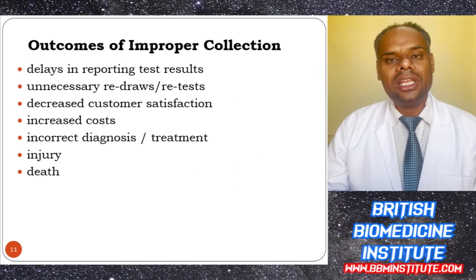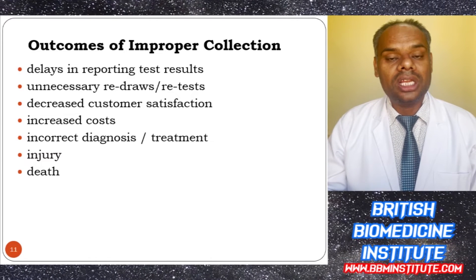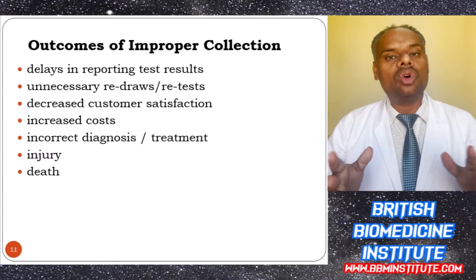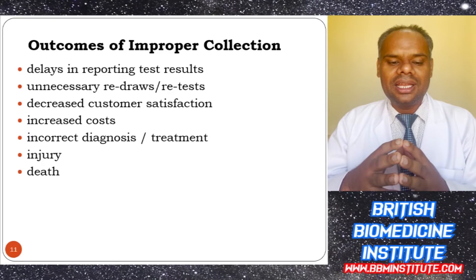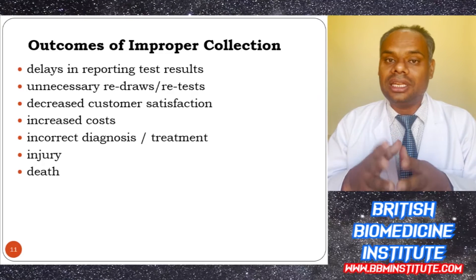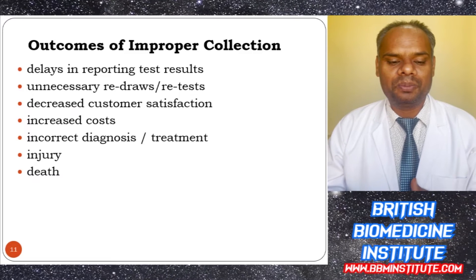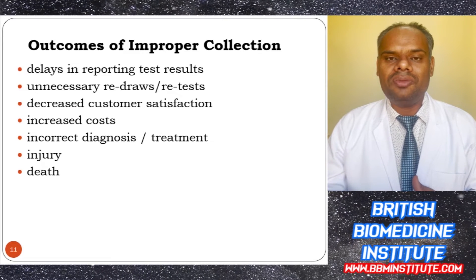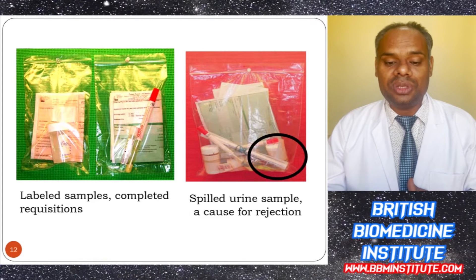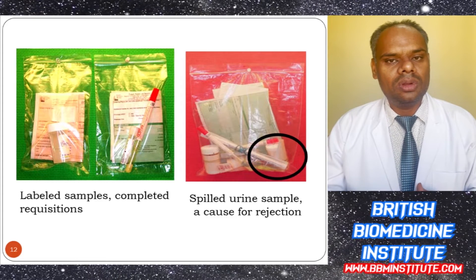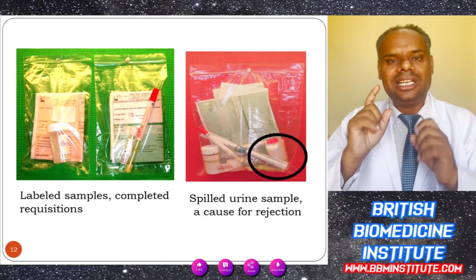If there is improper collection, it can result in delay in reporting test results, unnecessary redraws or retests, decreased customer satisfaction, increased cost, incorrect diagnosis and treatment, and injury — a patient can even die if an incorrect result is provided by the laboratory. We must ensure samples are properly labeled, requisitions completed, and vials are tightly closed.